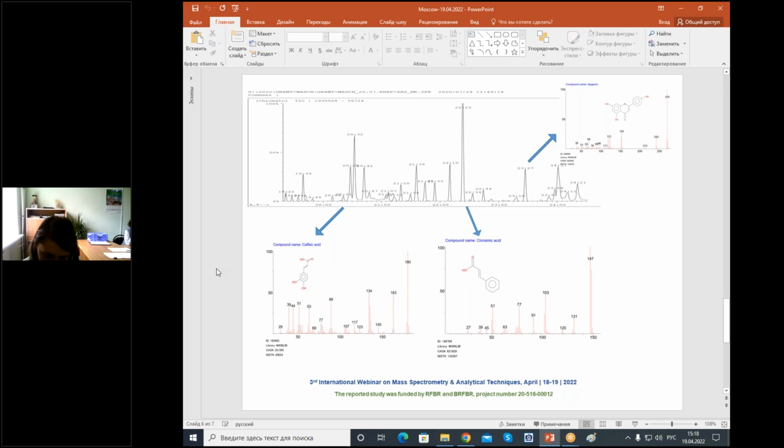The difference in the synthesis of these compounds was less obvious in the leaves of Amaranthus cruentus, cultivar Kripish.